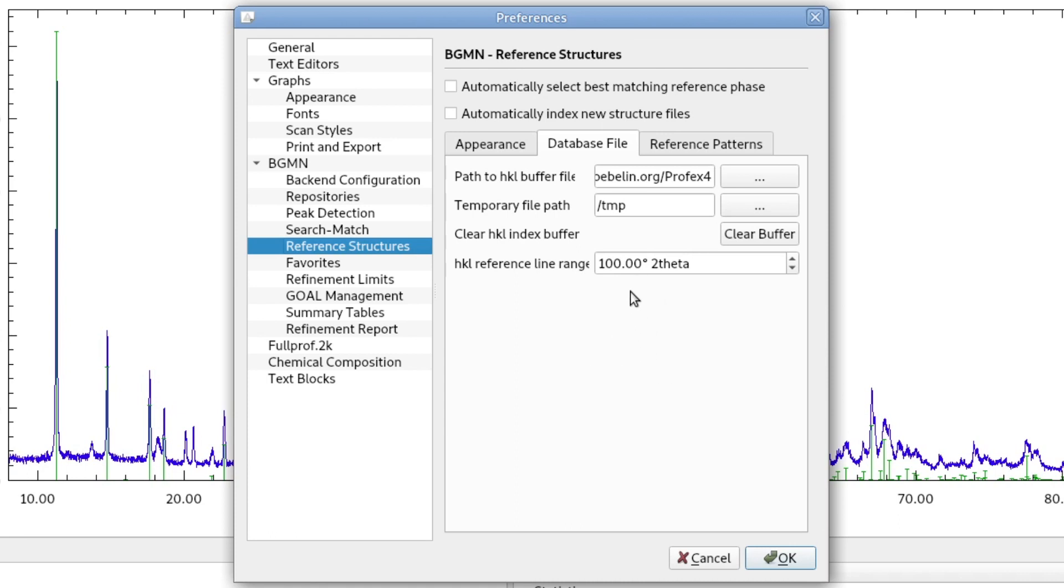But this will correspond to a different angle. For example, if you are using molybdenum radiation with a shorter wavelength, you will get peaks calculated up to about 50 degrees, about half of this value.